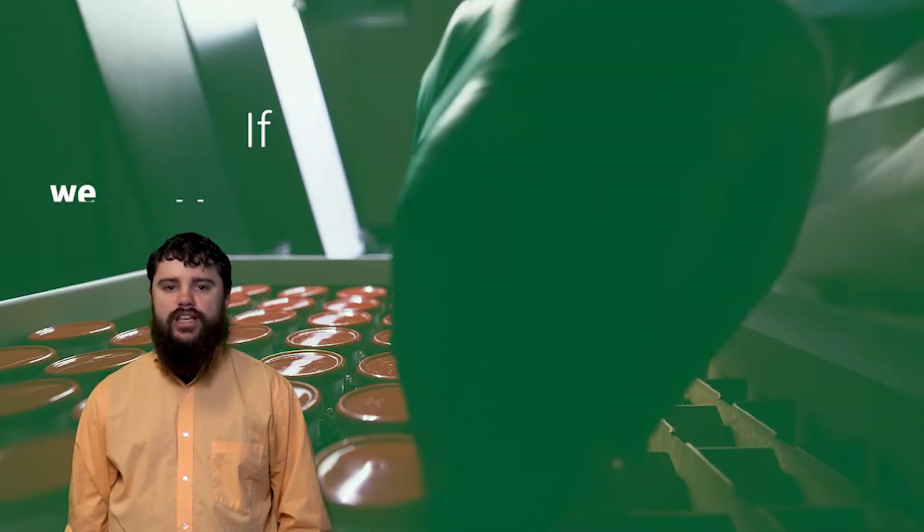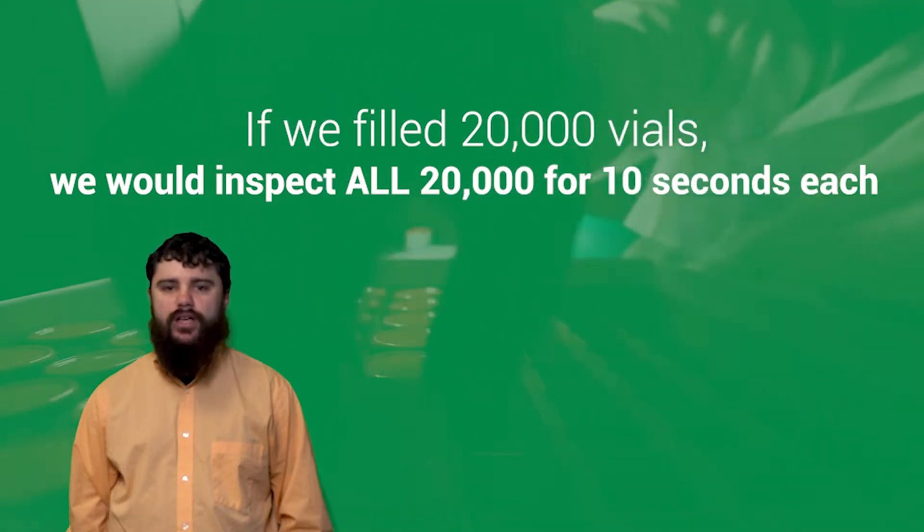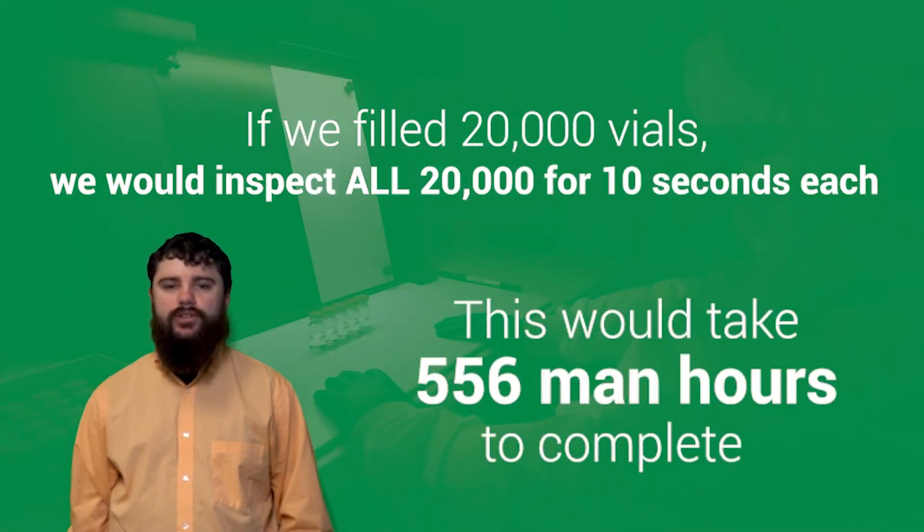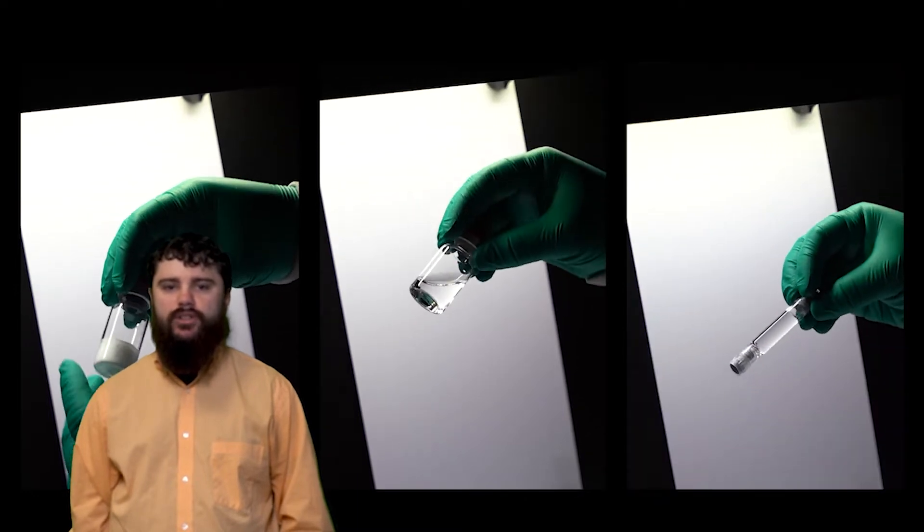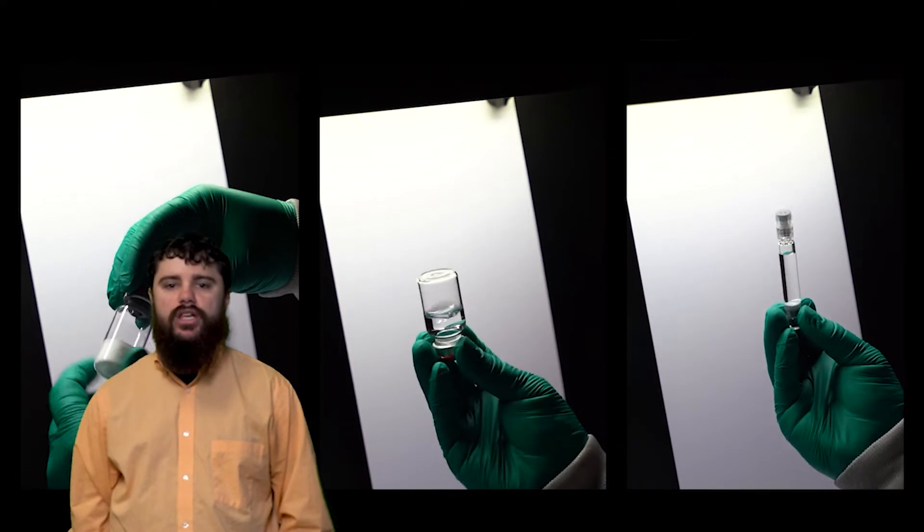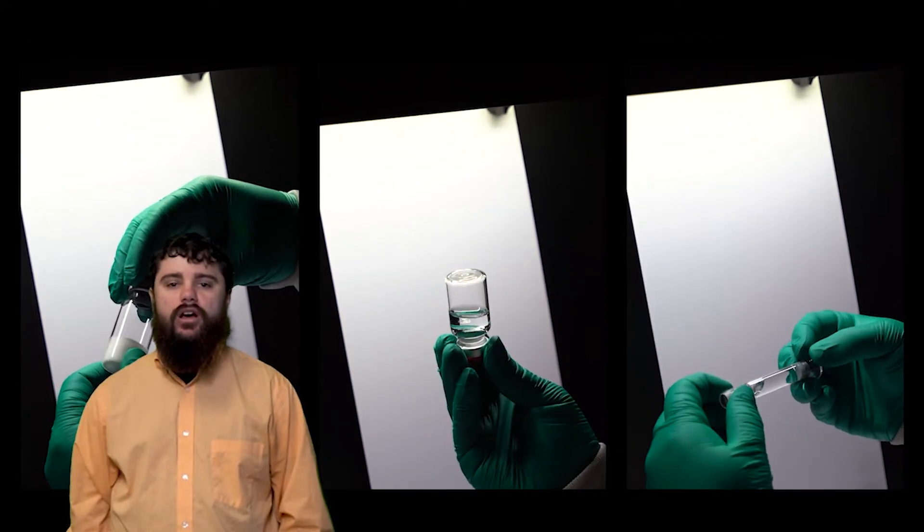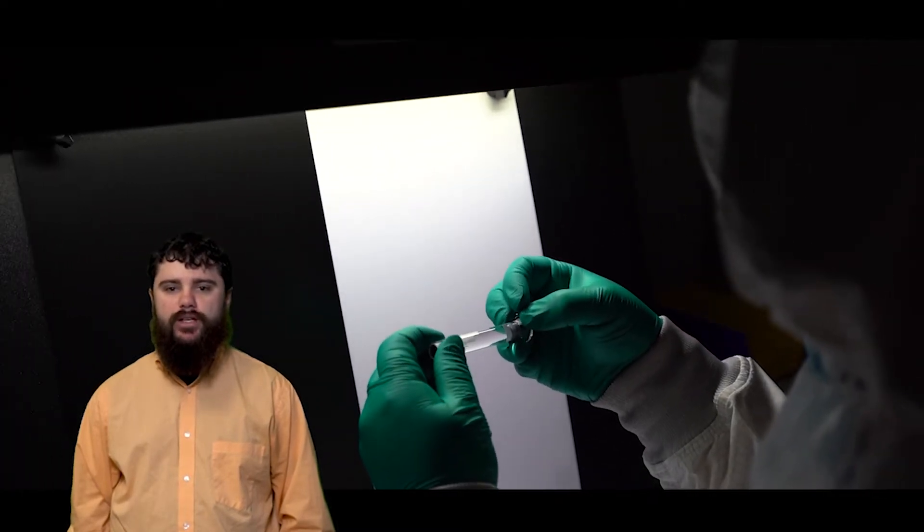No more, no less. If we filled 20,000 vials, we would inspect all 20,000 vials for 10 seconds each. A job that large would take at least 556 man hours to complete. After our 100% inspection, we have another inspector re-examine a small portion of the containers we looked at to confirm that we are not over-rejecting medicine that could go to patients and make them healthy, and we are not under-rejecting medicine that could be harmful to those patients. Once a lot is fully inspected, the acceptable units will be released for human use after all other testing is completed.